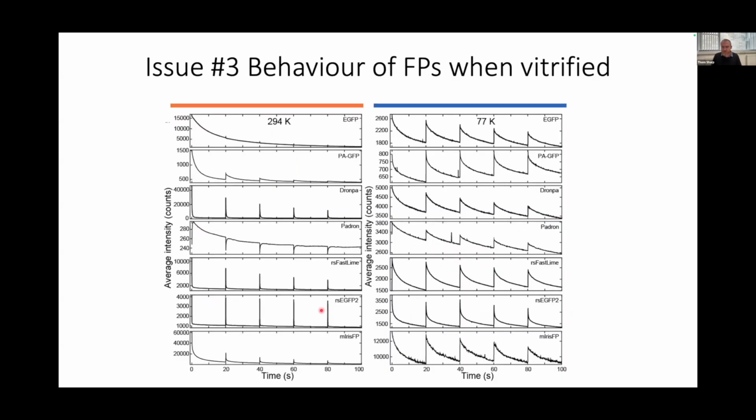And this is true of all of the green proteins we tried, including non-switchable GFP, activatable proteins, slow switches, fast switches, reverse switches, positive switches, negative switches, photoconvertible proteins. All of them behave pretty much the same at cryogenic temperatures. And this is exciting because it might mean that you don't have to reclone your protein in order to use this technique. If your fluorescent protein spontaneously starts blinking, you can do super resolution cryo-CLEM.